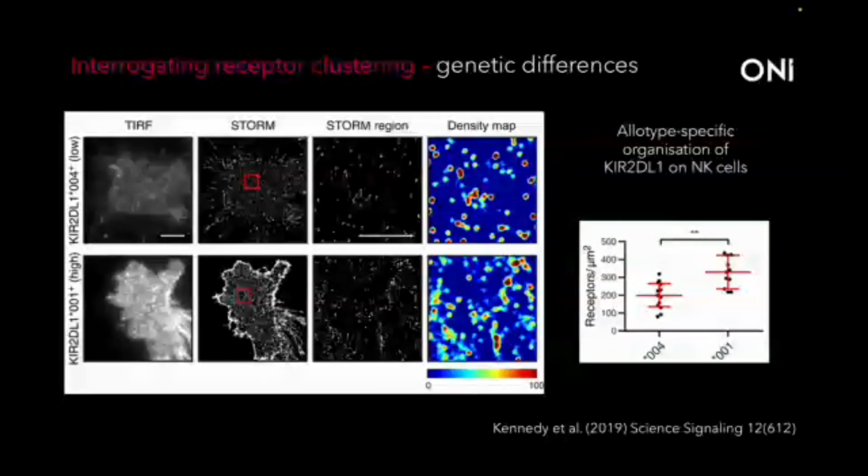So this helps to inform our understanding of the subtleties of immunology and how seemingly similar things can have very, very different outcomes. It's not uncommon in immunology to have things that look exactly the same insofar as our understanding, but then they have very different outcomes potentially if you put them into a patient, for example, if it's an engineered receptor. And it could be something to do with their nanoscale organization that just has not been characterized.